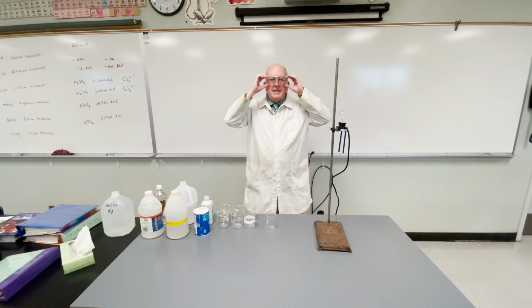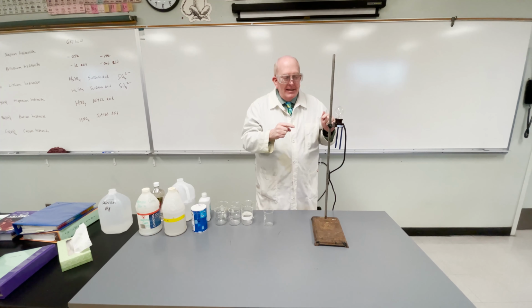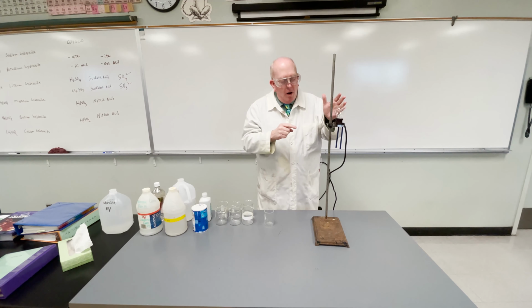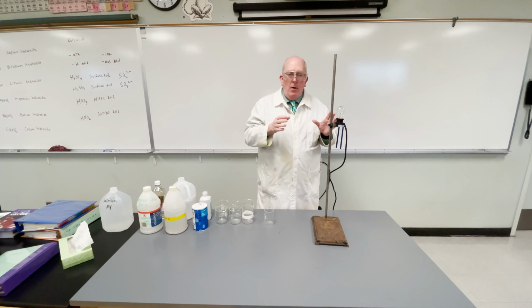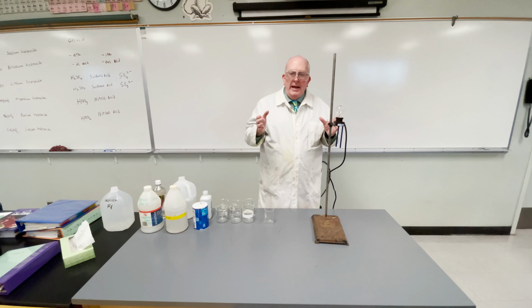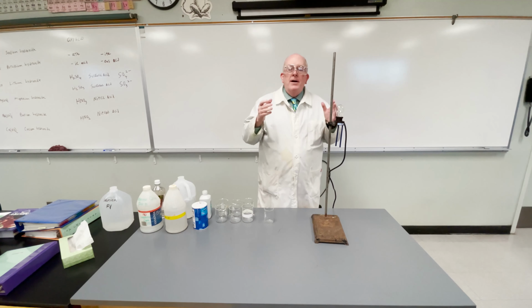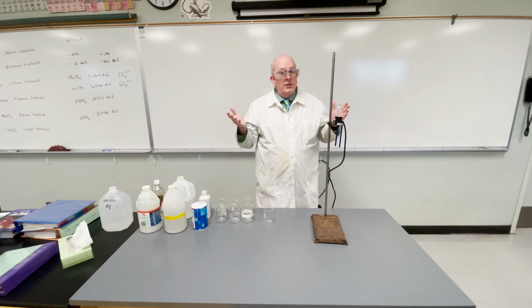Now, what we have here is a light bulb, except it's not a complete circuit. You see these two blue posts. In order for this to conduct and make the light bulb come on, those two posts have to be joined together somehow. And we're going to be doing it with some different solutions today so that we can talk about electrolytes and the difference between strong, weak, and non-electrolytes.